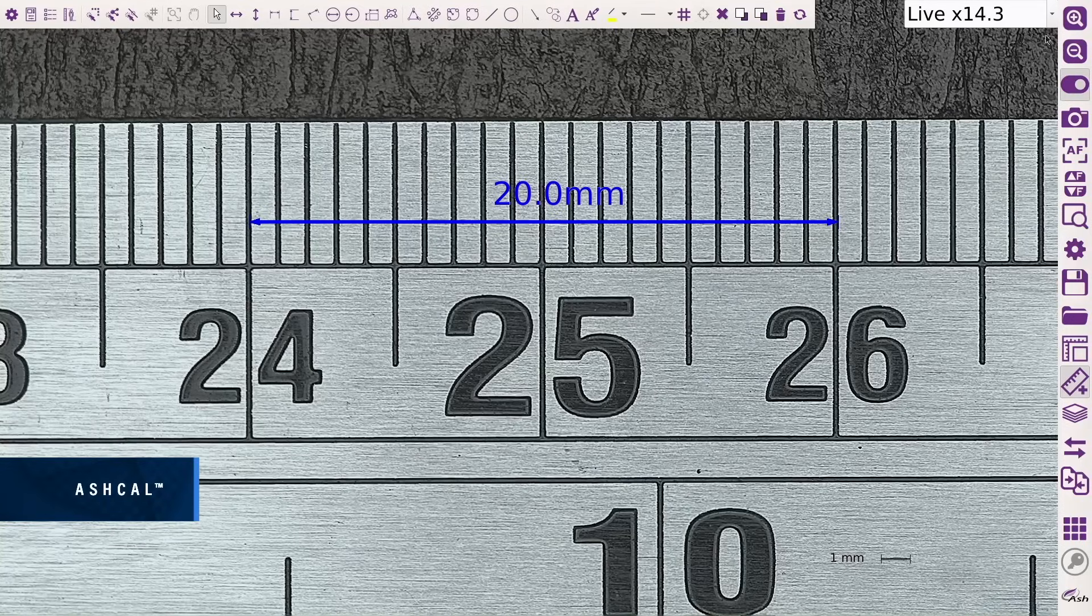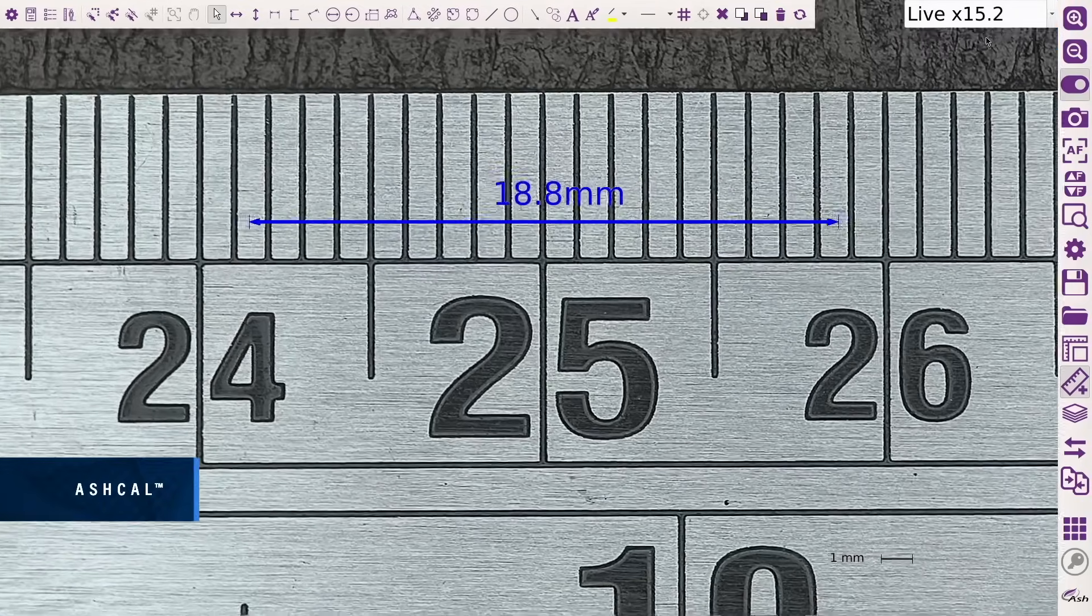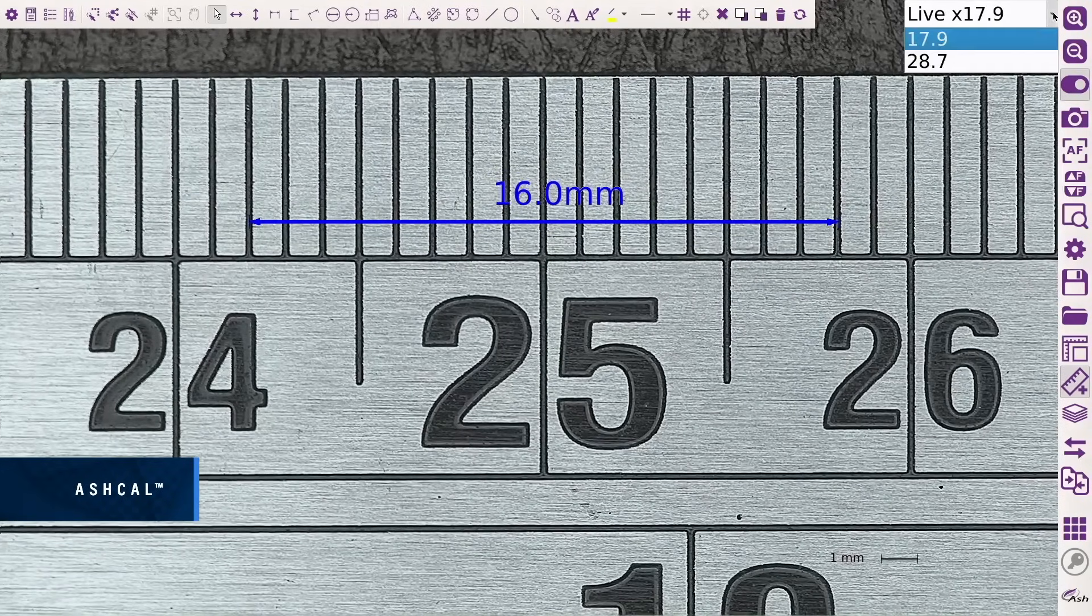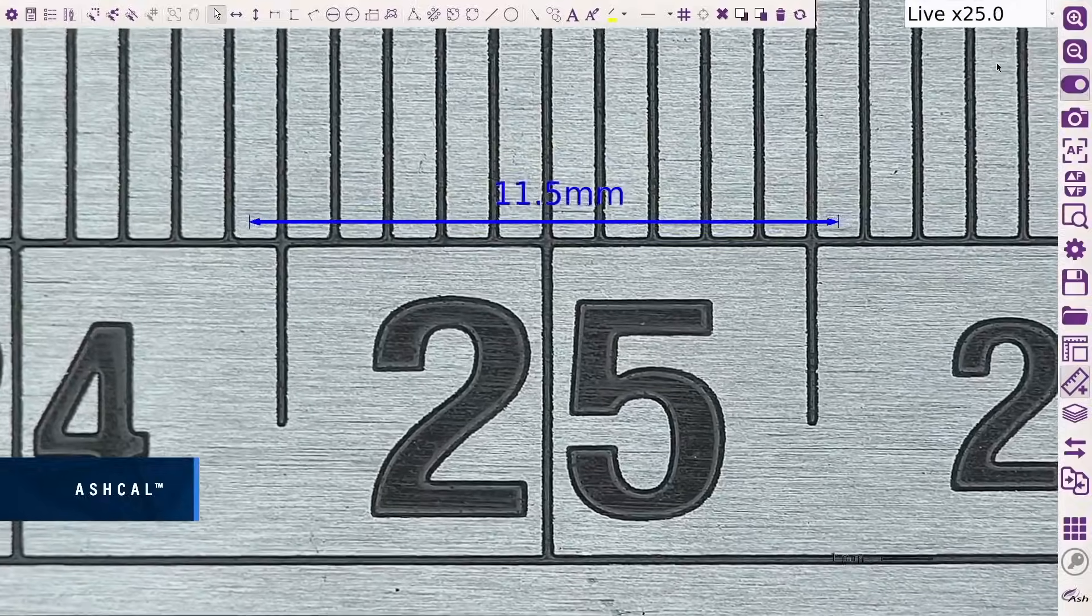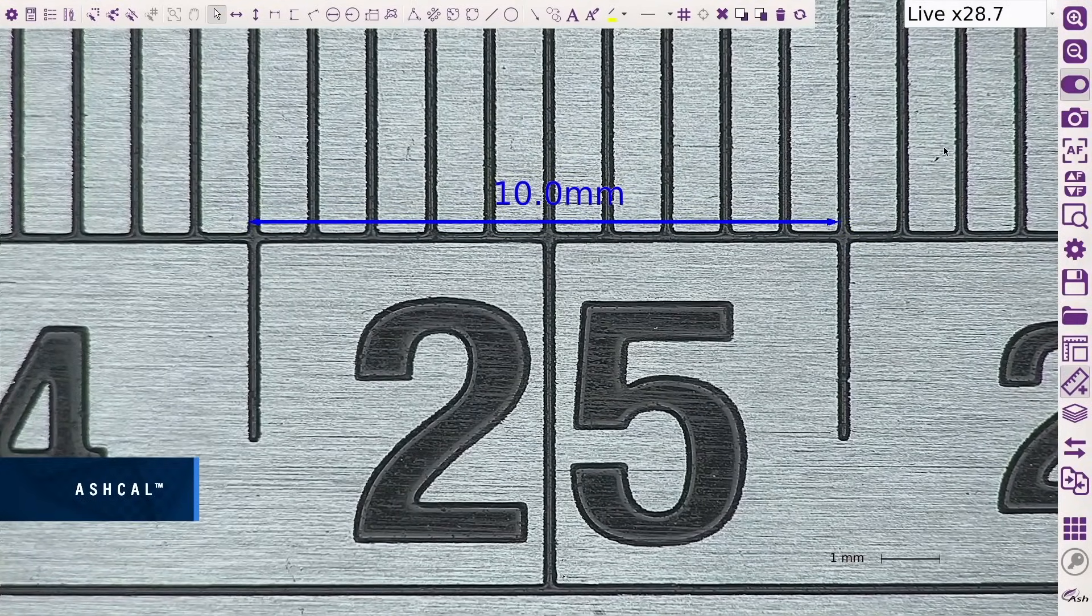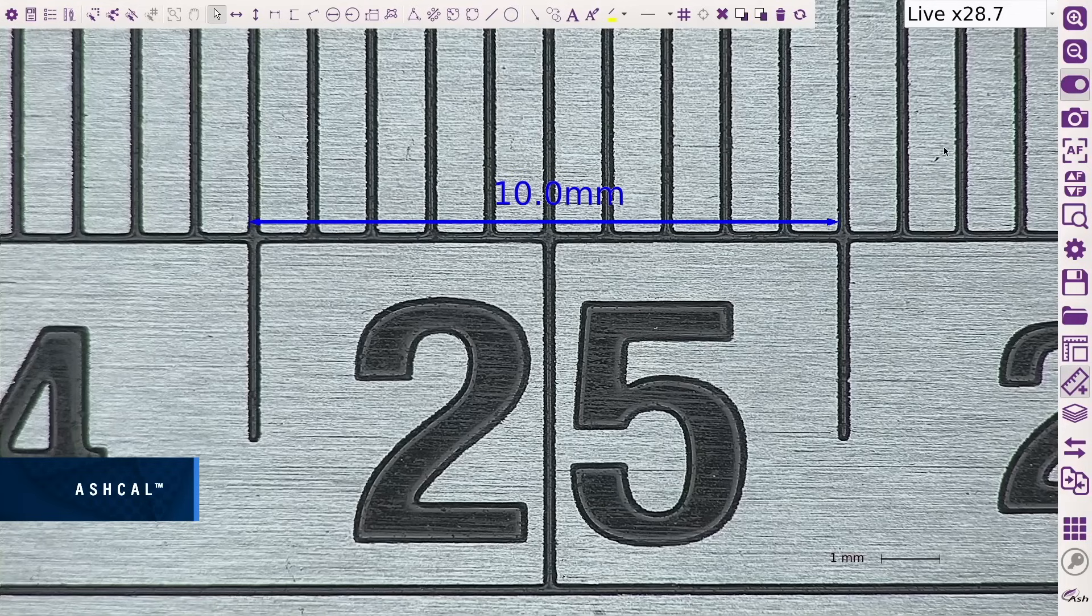Enhanced AshCal calibration technology continually maintains calibration at all magnification levels, removing the need for manual setup and recalibration, saving time and increasing efficiency. AshCal calibration technology is unique to Ash systems.